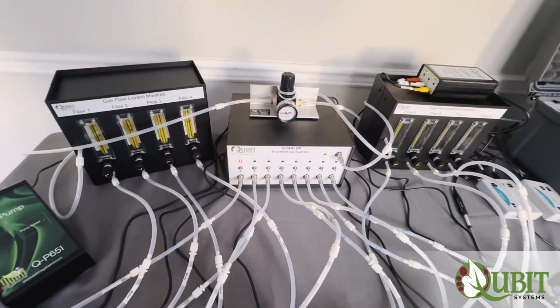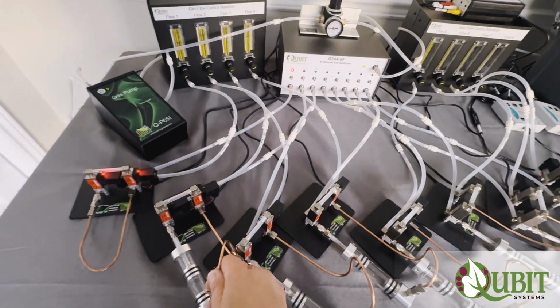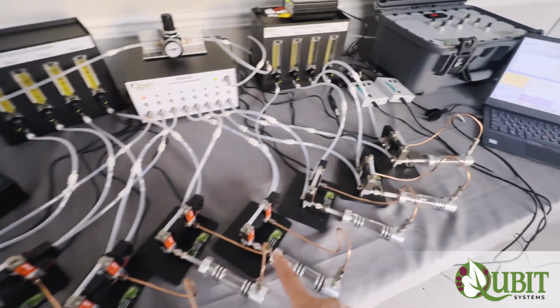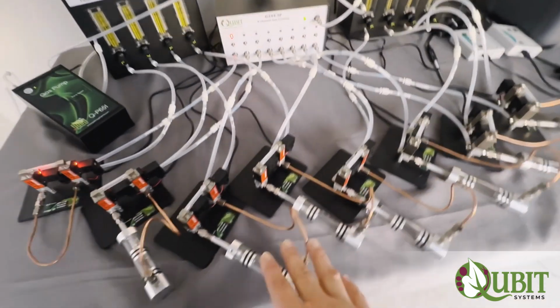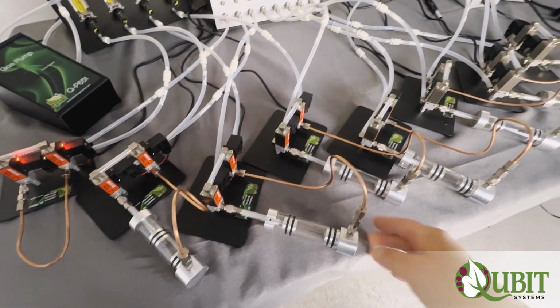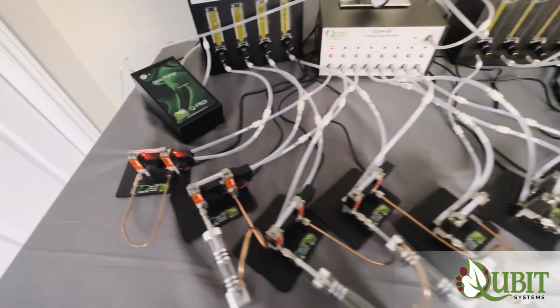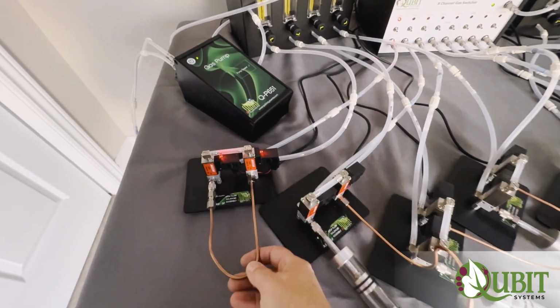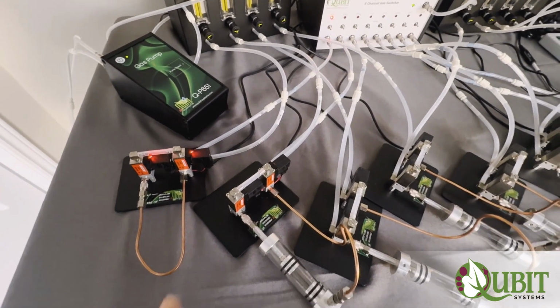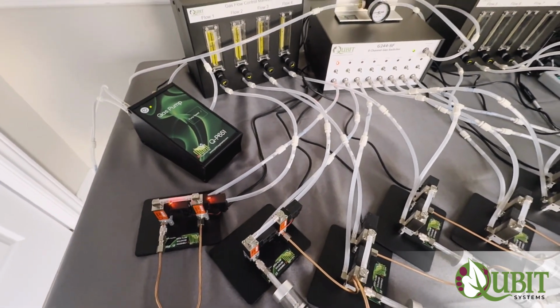That means there's connection of the stop flow solenoid assemblies to the back of the switcher, and we've got 8 of these assemblies. 7 of them have the variable volume chambers connected to them in the same way that I've described earlier. Channel 1 does not need a chamber unless you're doing a treatment where you do need to have one. So all we have is the tubing just being connected back on itself.